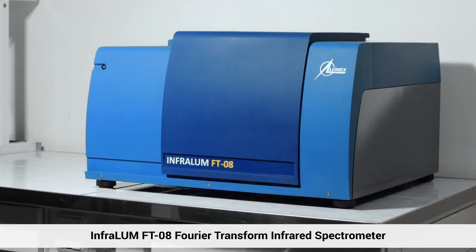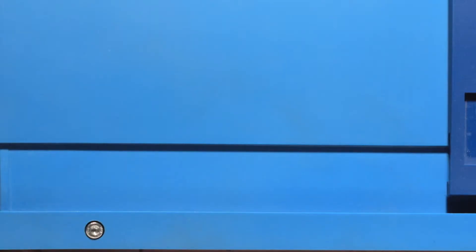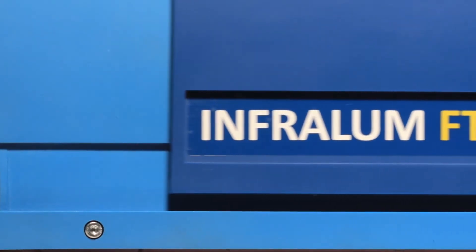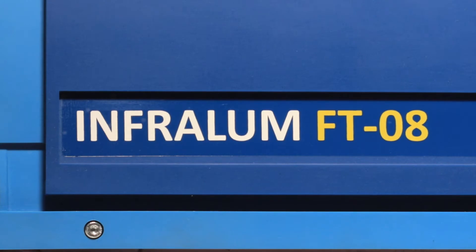We would like to demonstrate the Infralume FT08, a Fourier transform mid-infrared spectrometer developed and manufactured by Lumex Instruments.